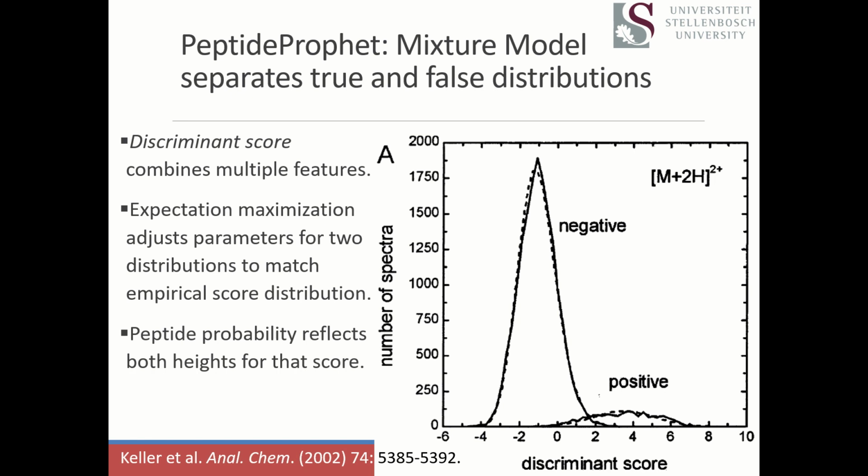But I would point out that way back in the day, in 2002, identifying 10% of your spectra was considered pretty good success. Today, we would scream and cry if that happened to us. So yeah, in a modern HCD set, you should expect that the number of positively identified spectra is going to be a lot larger than what you have in the negatives.